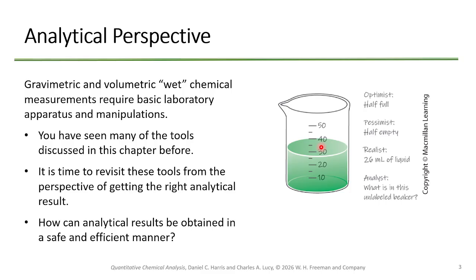Okay. So if you were to ever try to measure things out with a beaker, does anybody know how accurate that would be? It'd be about plus or minus 40% off. Okay? It's really, really, really bad. That's why you don't measure with a beaker, right? And so if you measure with a graduated cylinder, it's a little bit better, but not amazing. If you measure with a balance, usually you can get really good, because usually they're less than 1% off. And so balances are pretty good.